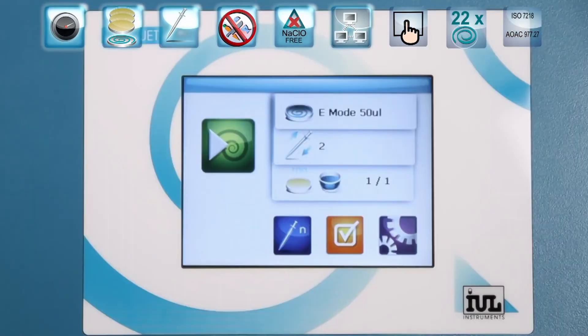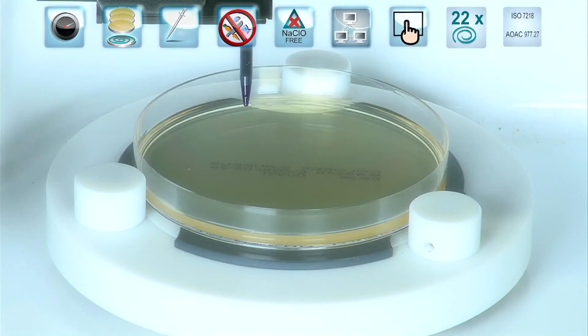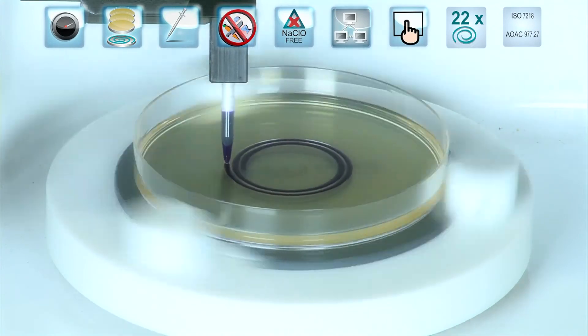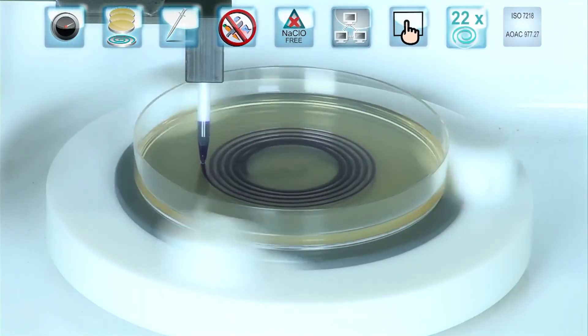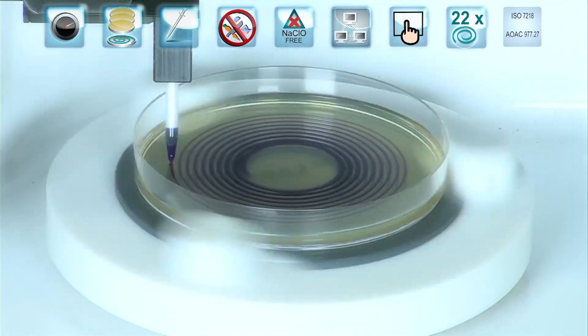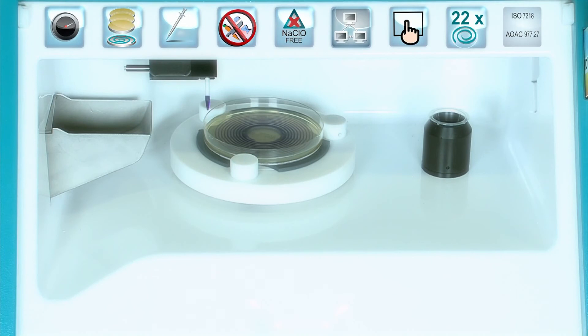EDIJED2's streamlined intuitive software is commanded from a color touchscreen panel. IUL also improved spread times in this device. EDIJED2 stands out as the spiral plater with the widest range of spiral distributions, making up to 22 of the most used distributions.